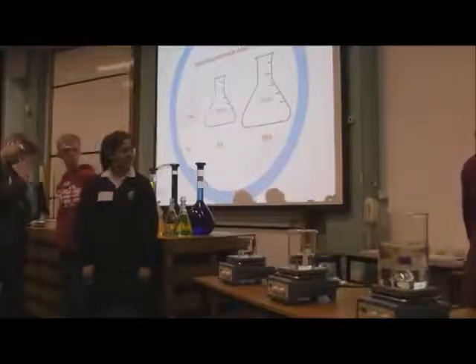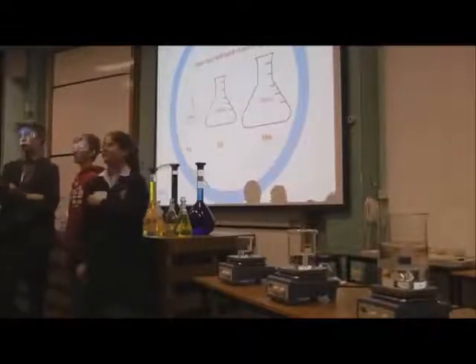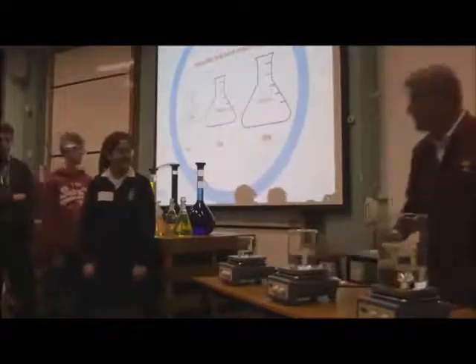Have we got glasses sorted? Have you got any spare glasses? I got some. All right, thanks, Graham. The efficient technician helps me out here. Yeah, I'm really something good. Okay. And now we're mixing them up.